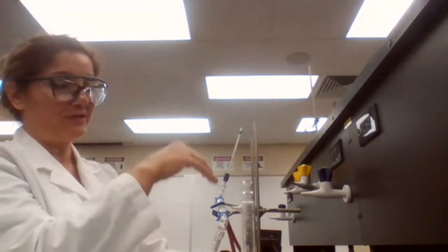This is called a theoretical plate, which is forming along the fractionating column. Every time it pushes the vapor of B down. What does that mean? It means the chance that you can get a more pure sample of A is greater when you are using fractional distillation.